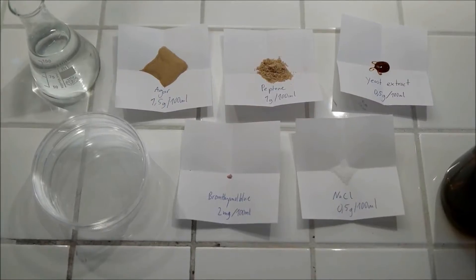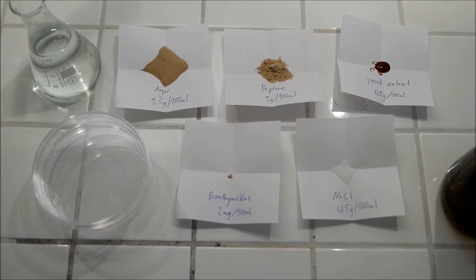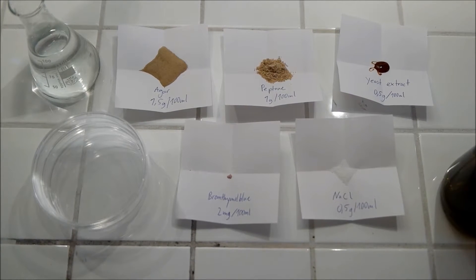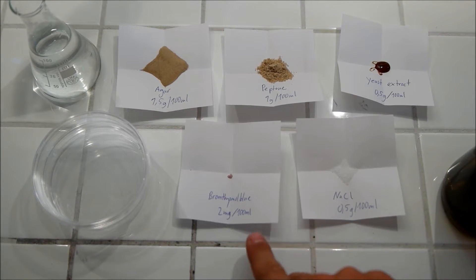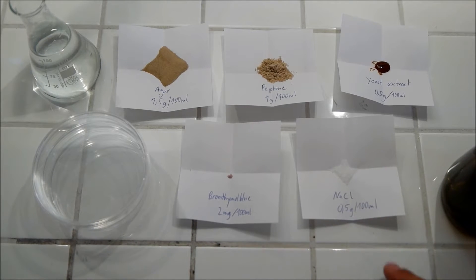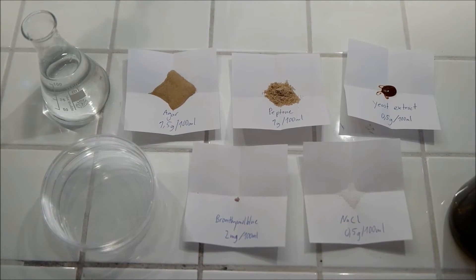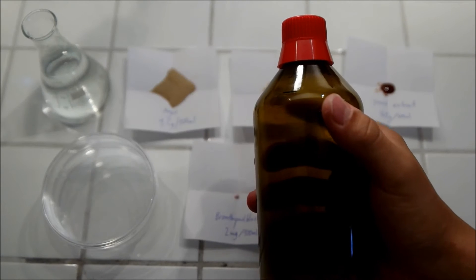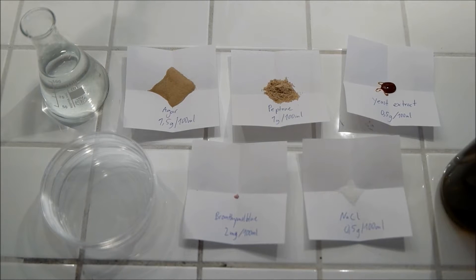It's very simple to make the Bromothymol Blue medium for the agar plates. All you need is agar, some peptone, yeast extract, Bromothymol Blue — only 2mg per 100ml — and sodium chloride, 0.5g. You just have to mix them together in a bottle, which you'll put in the microwave to heat it up so that you've got your agar solution.